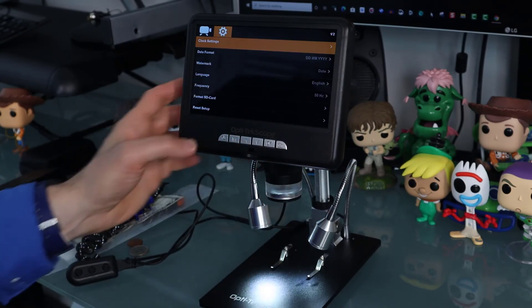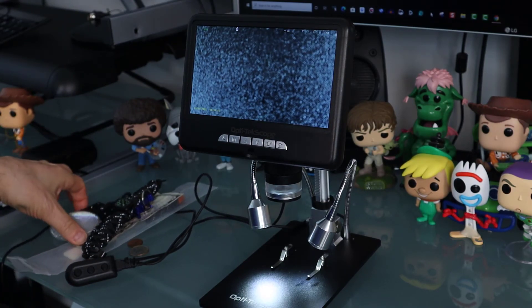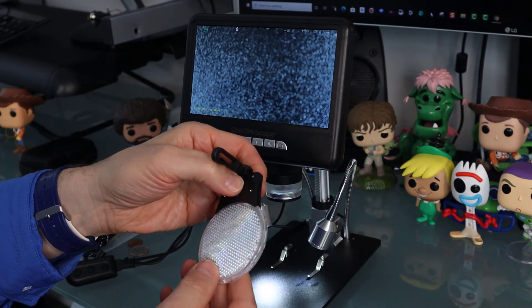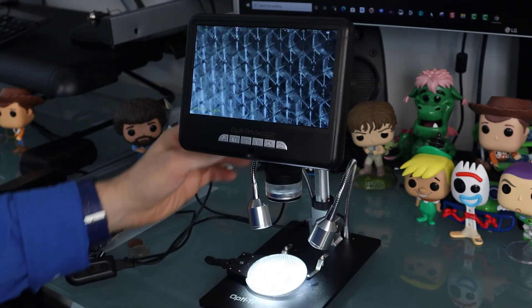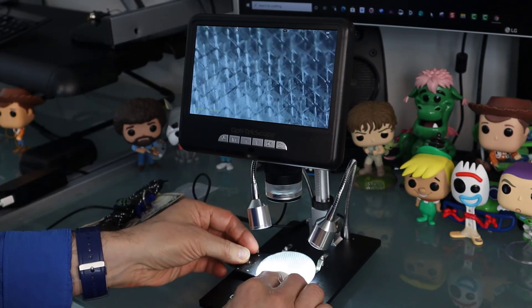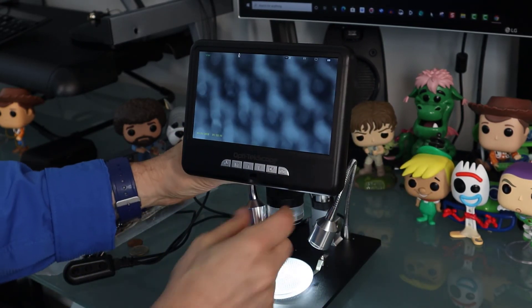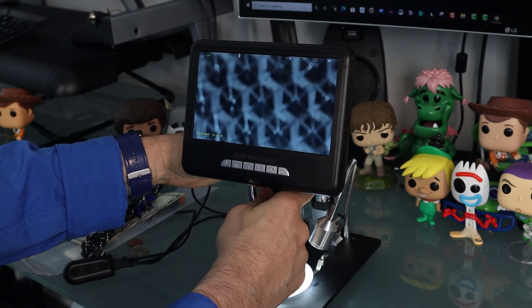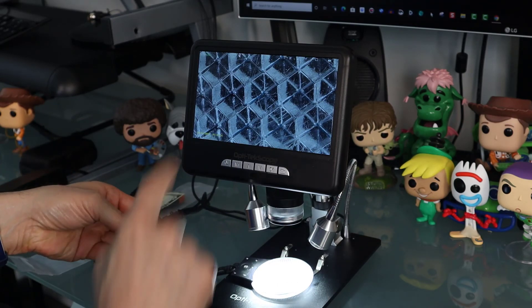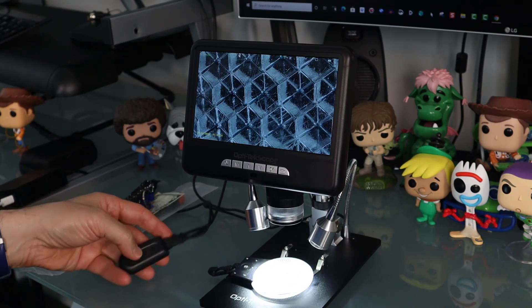We're going to back out of that. Now let's start with this cool reflector product. You can turn it on to flash, but we're going to put it underneath the microscope. You can see how cool that is — it almost looks like crystals. If you want to go down a little further you can, and then use the focus knob to really get in there. You can make the screen brighter or less bright, so you can control that.